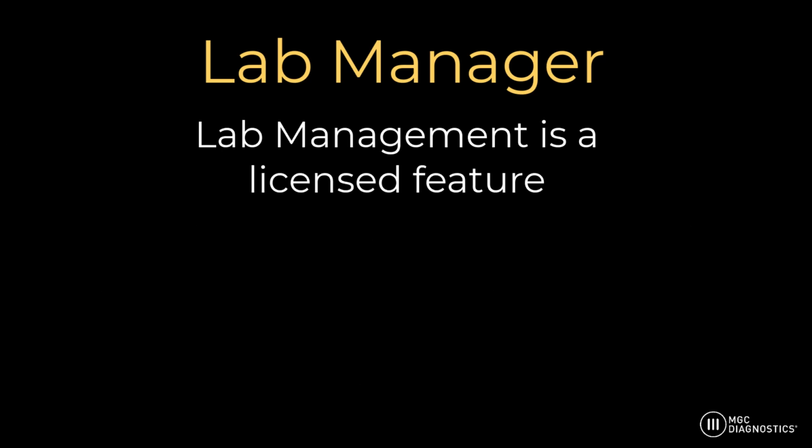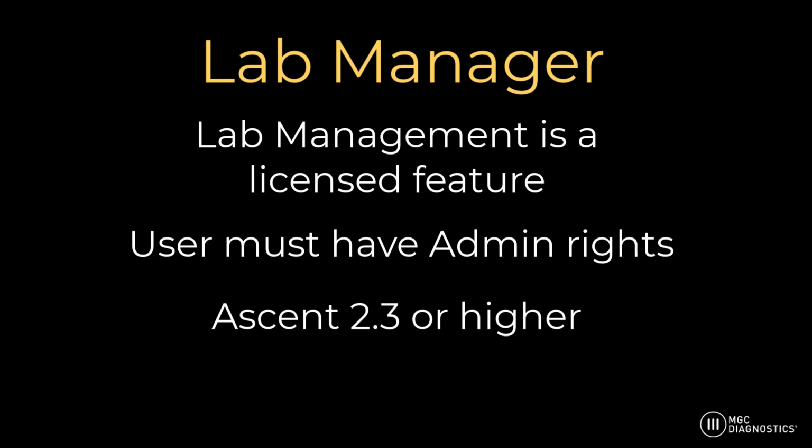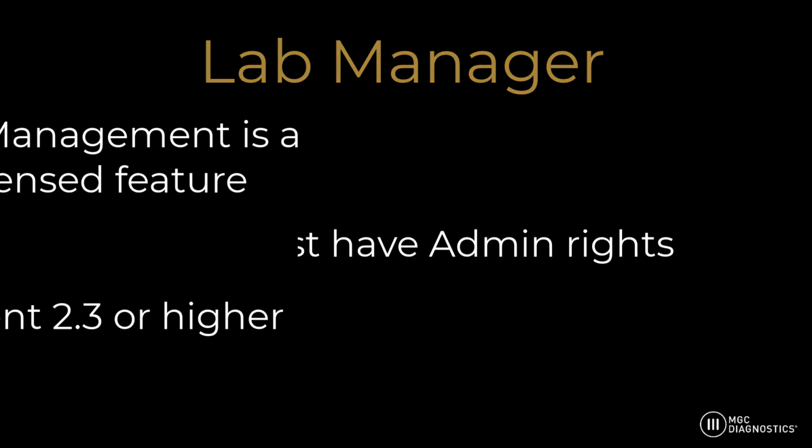The Lab Management tool is a licensed feature. Consult your local sales representative if you have questions about obtaining this software option. Users must have admin rights to access the admin menu and use this feature. Lab Management is only available in Ascent version 2.3 or higher.